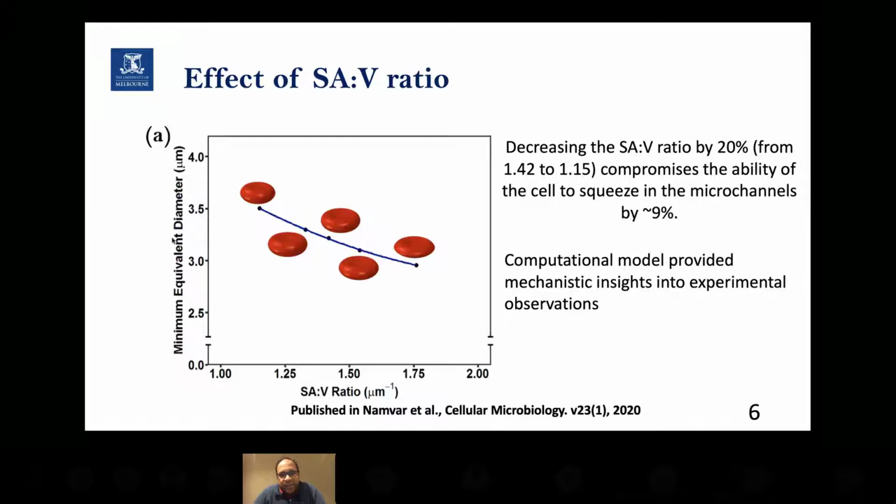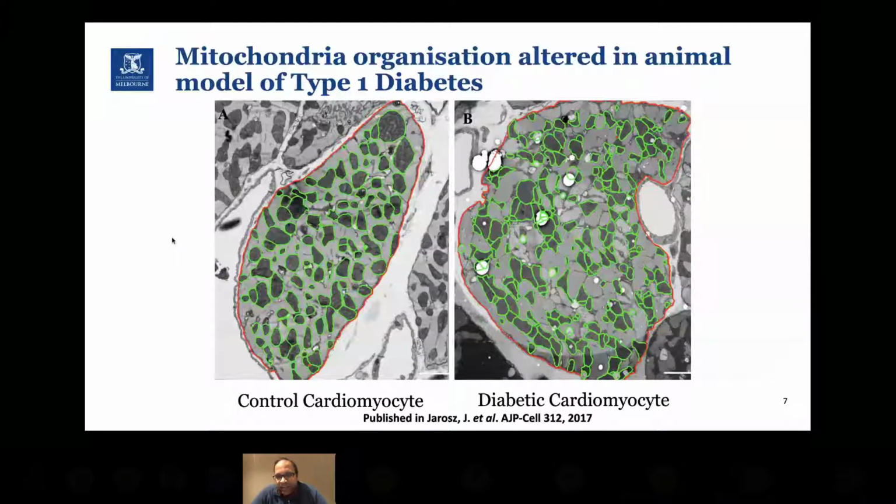Going one step further as an example, and now getting into more of the reason why we did this EM study. Like I mentioned before, we're interested in looking at how cardiac cells get their architecture and how it's regulated or dysregulated in disease. One of the things that we've been working on is studying how cardiac cell architecture changes in diabetes-induced cardiomyopathy.